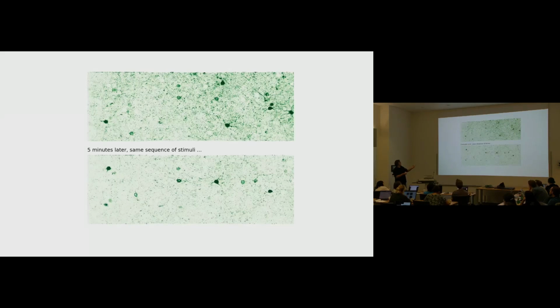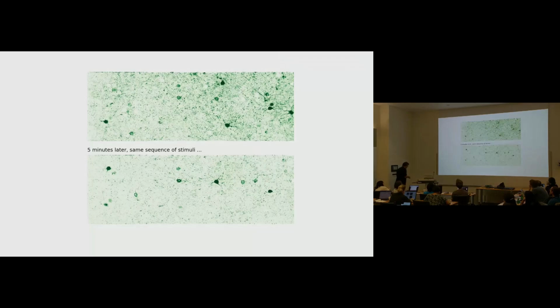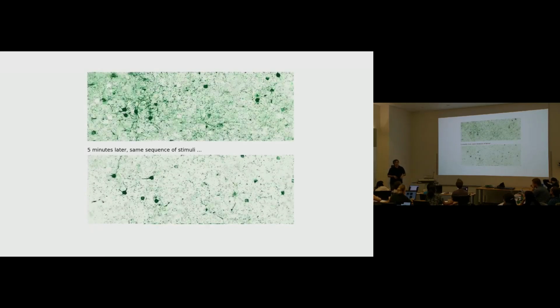The thing that we're actually taking most advantage of is just how almost apparently randomly these cells are lighting up at different times. This is one of the best properties of these movies, is the fact that neurons have this kind of noisy aspect to them, that they fire action potentials. Actually, in this case, this is in visual cortex, and we show the same movies twice, the exact same sequence of stimuli twice. We got completely different patterns of activity.